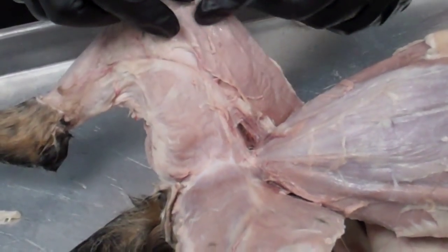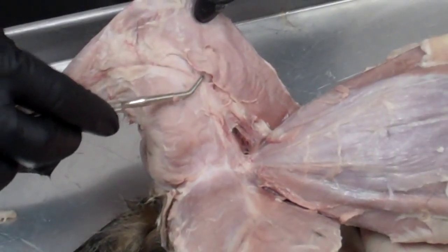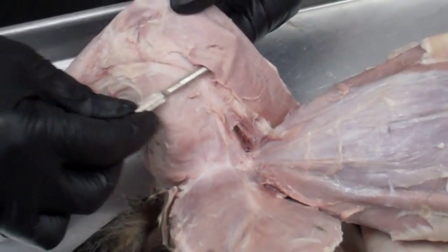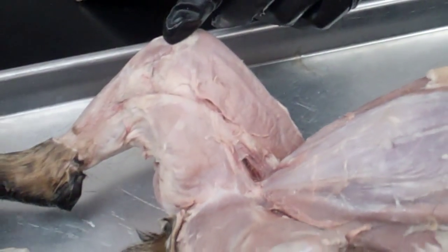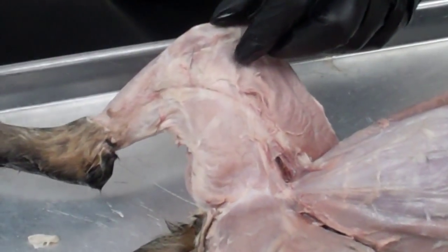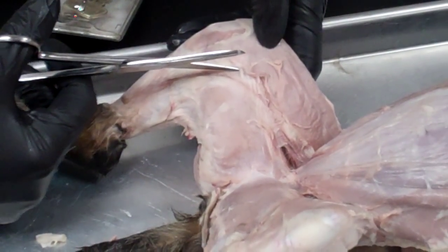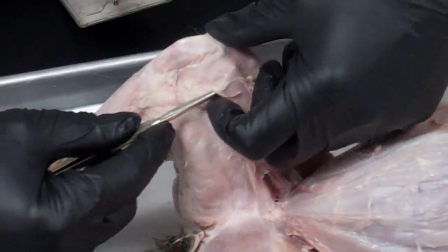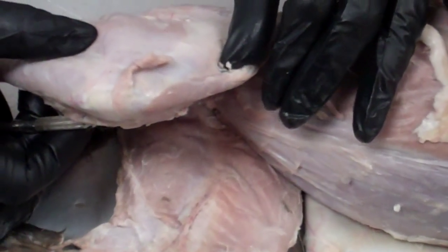The first muscle is called the sartorius. I've just barely opened up the sartorius here. I'm going to stick the probe underneath it in order to free it up a little bit. You can see from the probe that it's a very thin muscle, and it extends down here. I should be able to get underneath it.